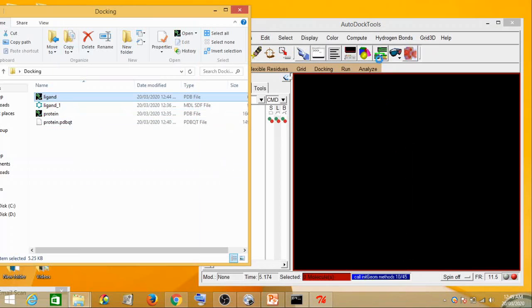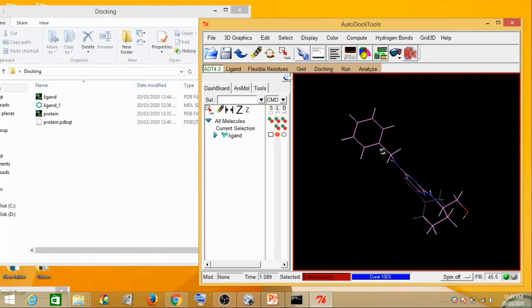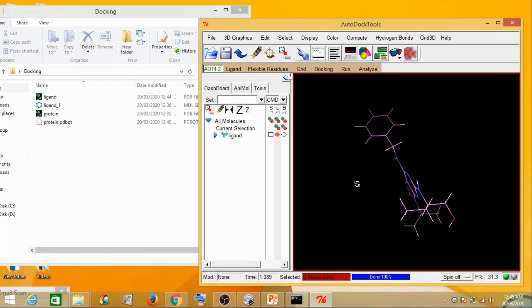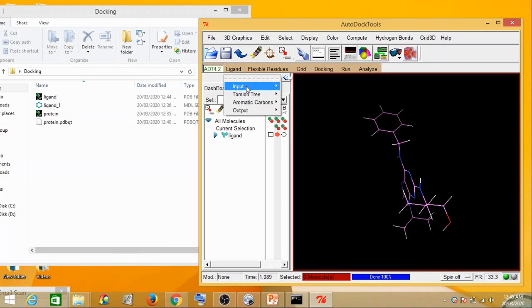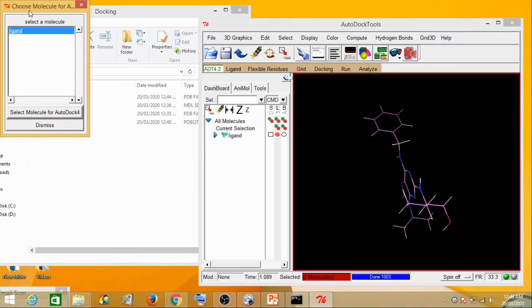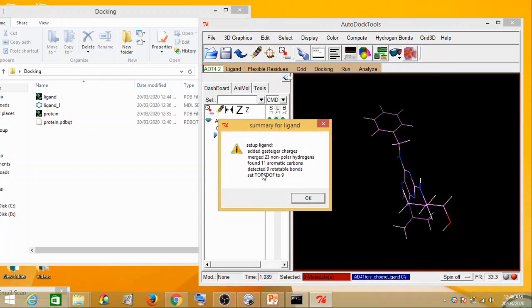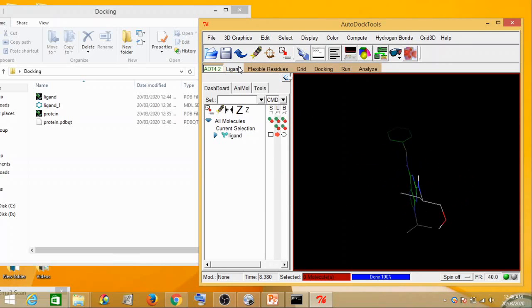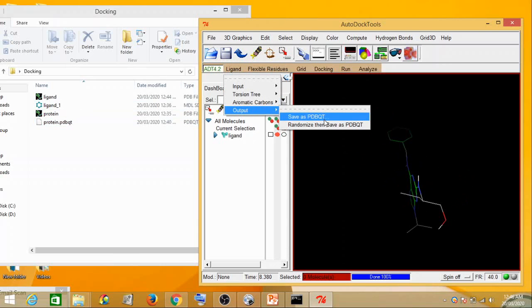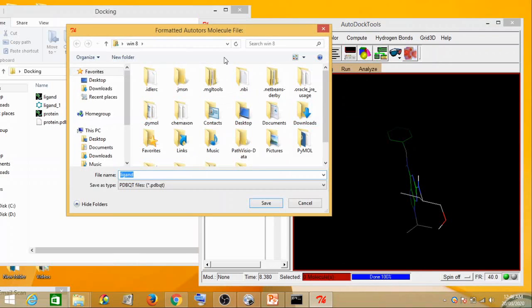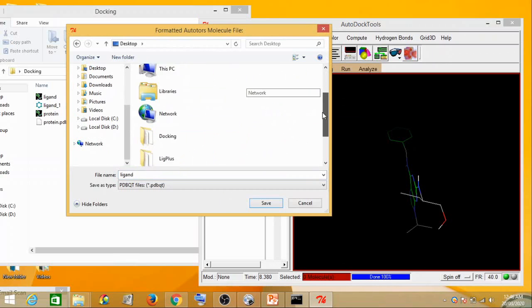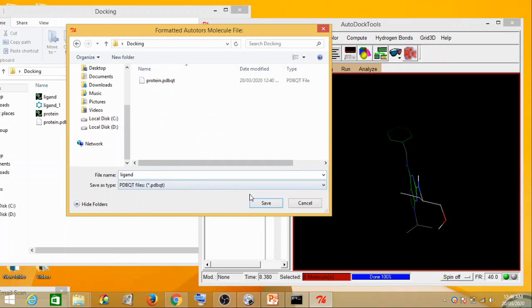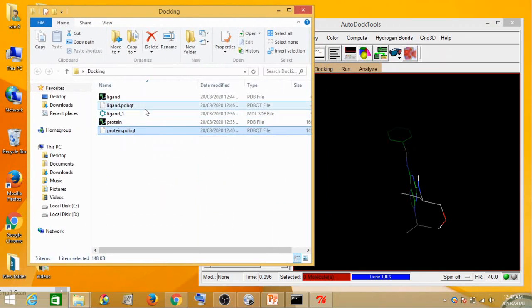Now we take this ligand PDB file and drag and drop it into AutoDock Tools. To carry out ligand preparation, you go to Ligand, click on Input, then Choose, select ligand, and then Select Molecule for AutoDock 4. All the charges and rotatable bonds are detected and it finds everything — then you click OK. The next step is to save it as a PDBQT file. You go to Ligand, click on Output, and save it as ligand.pdbqt in the docking folder.